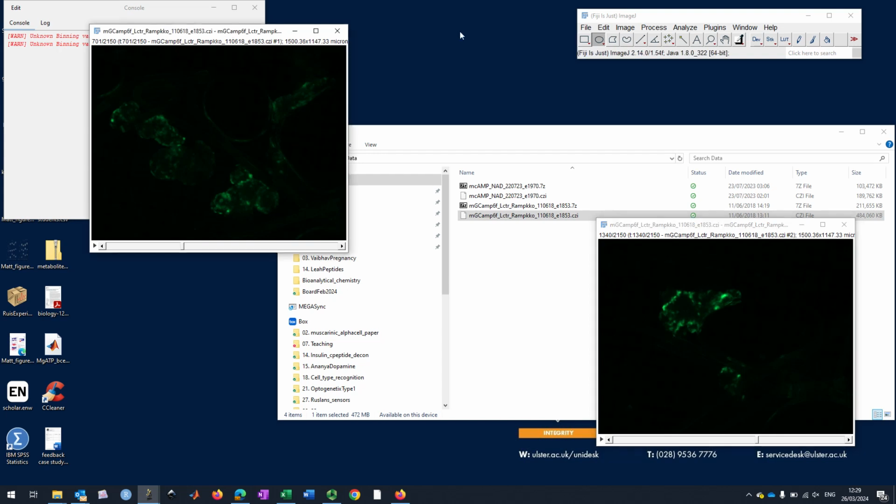Firstly, let us correct for any motion artifacts. What are these motion artifacts? The recording is long and cells move throughout the recording a little bit. Therefore, we will prefer to ensure that this motion does not contribute to changes in our fluorescence intensity. How do we do that?